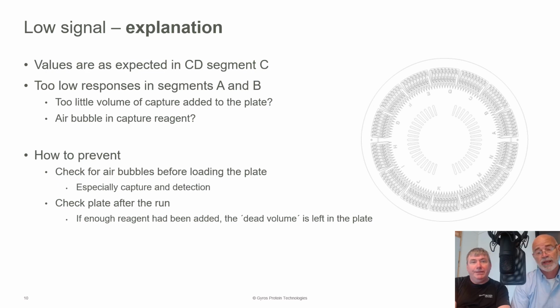But I will say that having worked in mouse CSF in the past, I didn't always have extra volume. And I know that what the system asks for in terms of total volume from the samples perspective is enough, including the dead volume, to do all the replicates that you want. So you don't have to really add more, especially if samples become precious. But do make sure that your pipettes are calibrated so that you're adding an accurate volume. Never lie to the instrument. That's my rule. Yeah, very true.